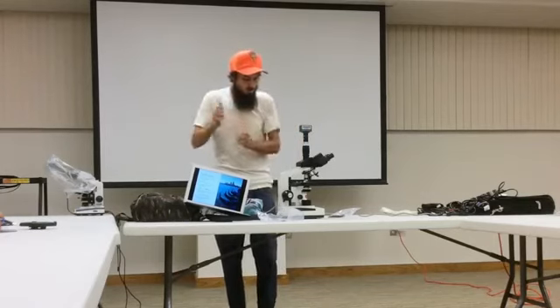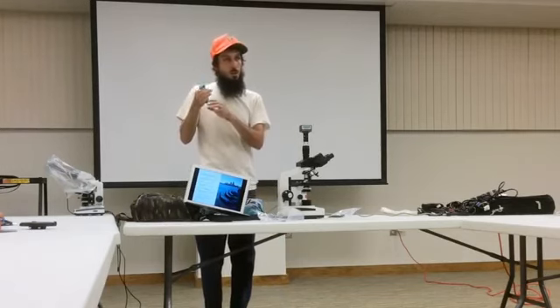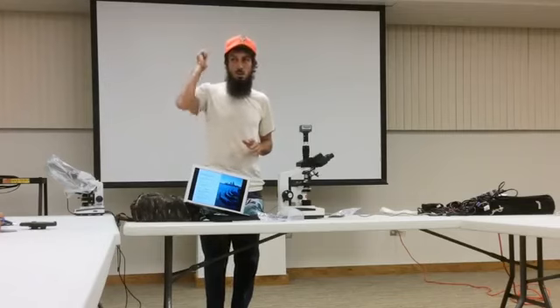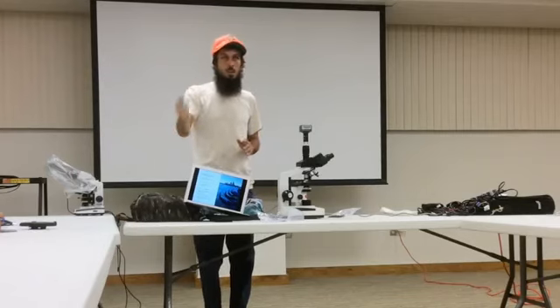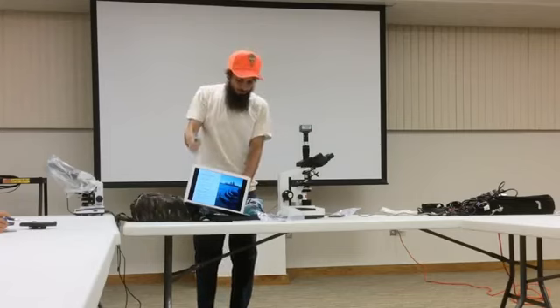So then the next part is to shake it, because all the biology is on this stuff. Just as consistently as possible for about 30 seconds. I'm not trying to super tear it off. I'm just trying to be pretty even with this.